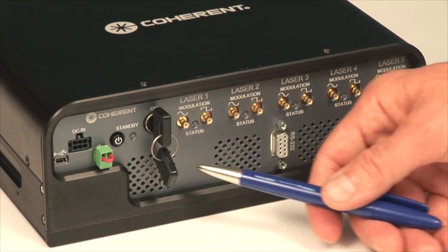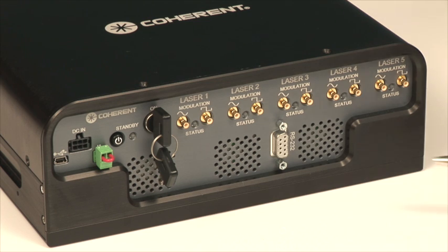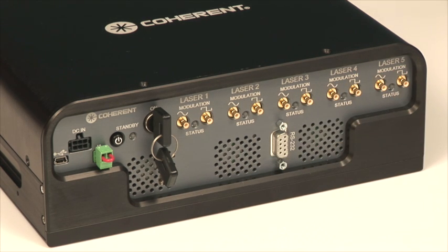The laser box has three exhaust vents for thermal management. There is a fan pulling air through the laser box keeping the products cool. This is complete thermal management for five OBIS lasers.